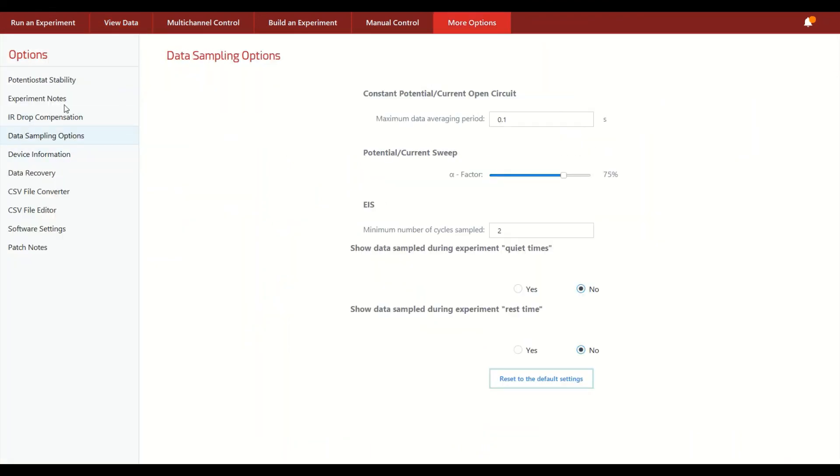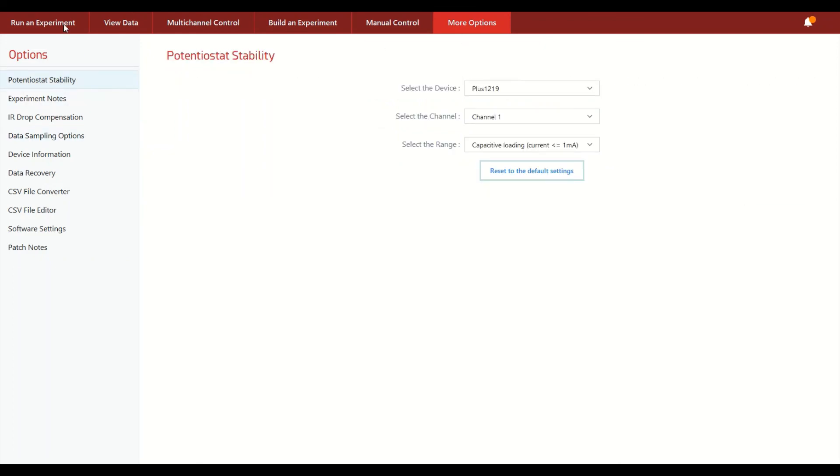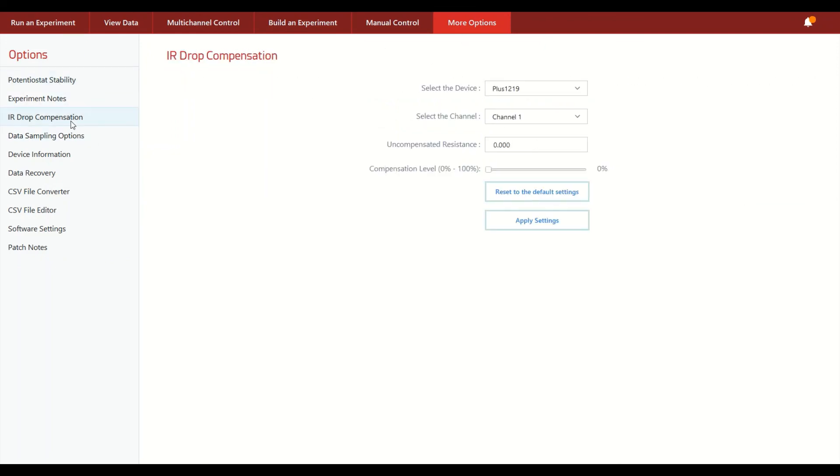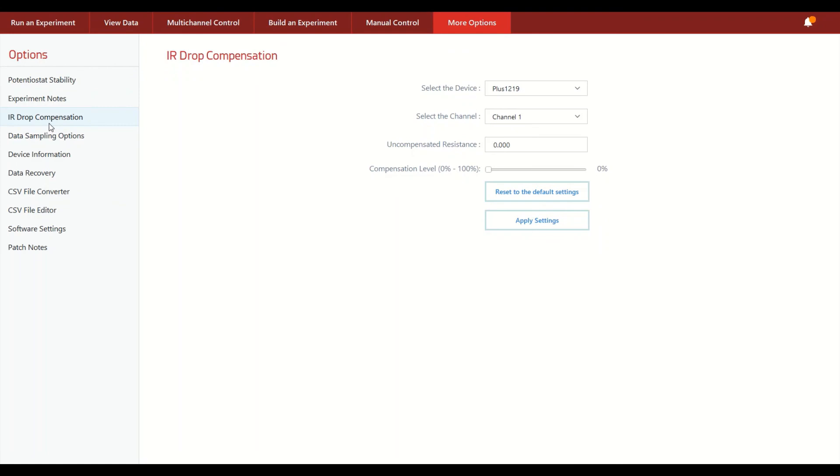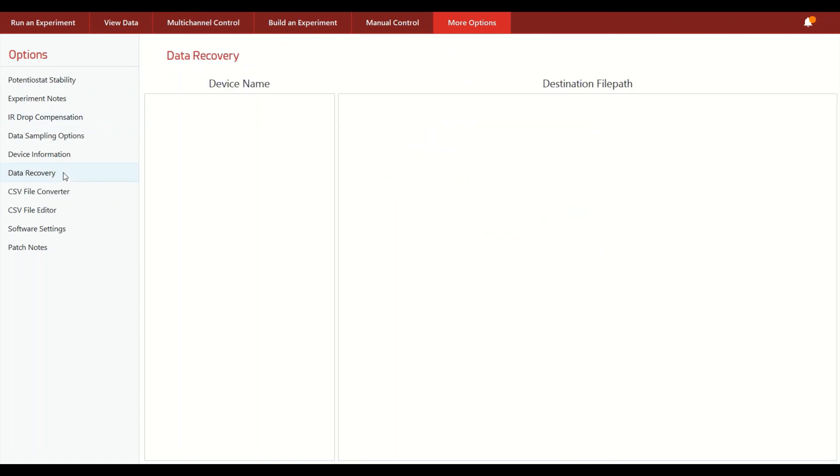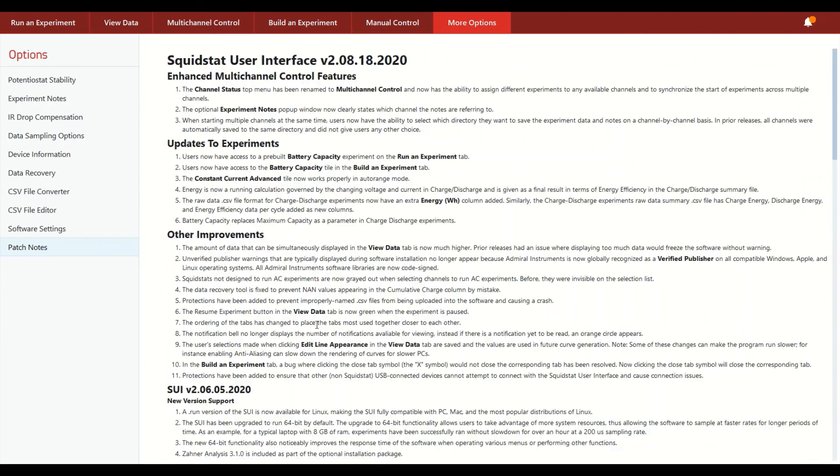And really the main thing to say about the more options menu is that we have put in here all the different less used but still very important capabilities for more advanced users or users that have more specific needs. For example, by changing the stability settings of different channels that you are operating, doing IR drop compensation, being able to access data that was lost, because we do have a special data recovery tool where you can actually save data that's being collected during an experiment, even if your computer loses connection to your Squidstat, whether or not it's because it was disconnected or the computer crashed for some reason. And we also are continuously updating our software and all updates are free in perpetuity. They're accessible by downloading our software from our website admiralinstruments.com.